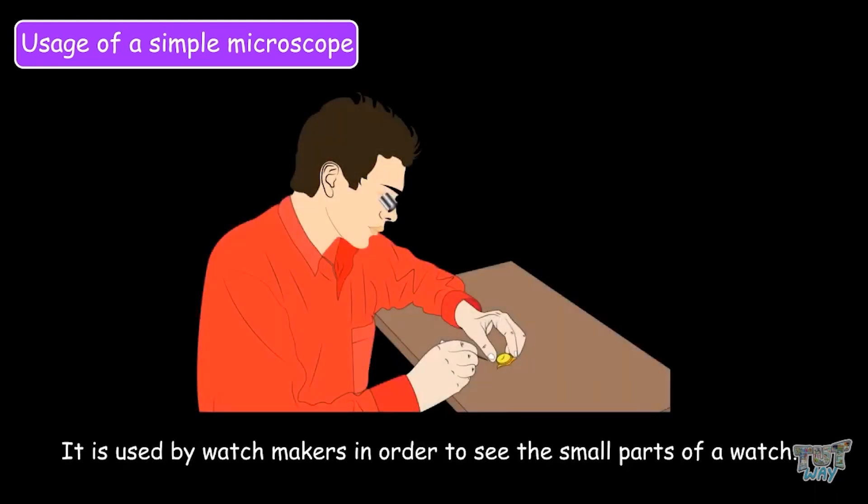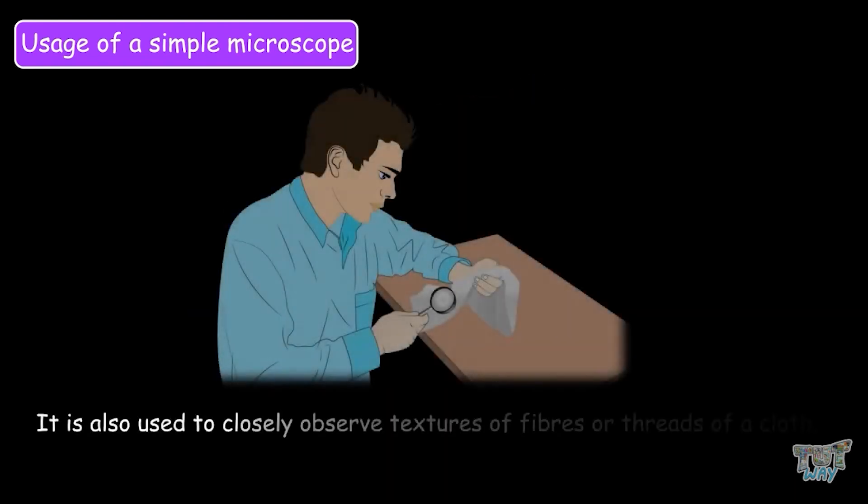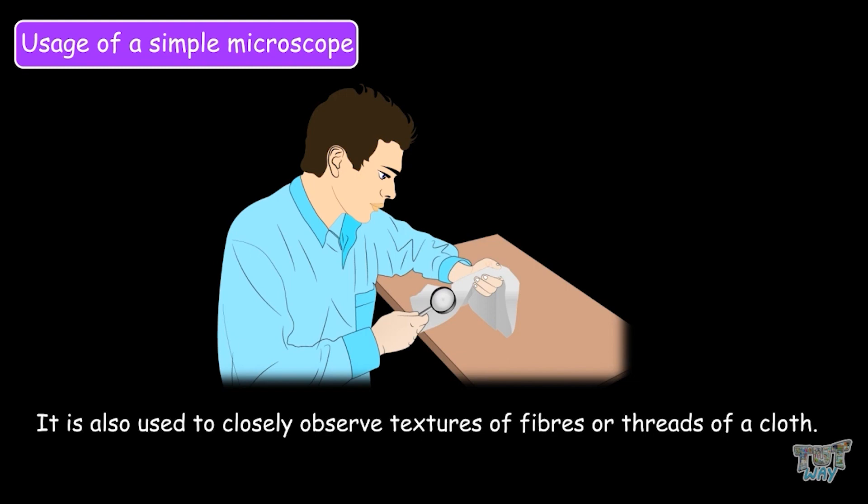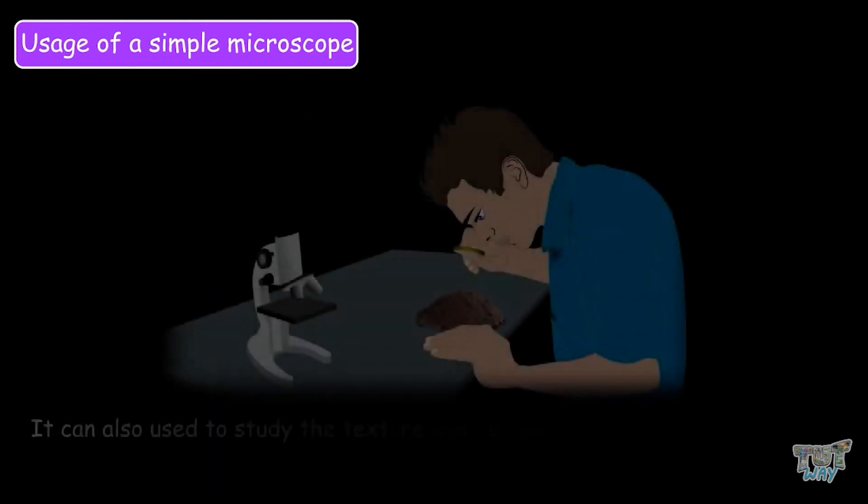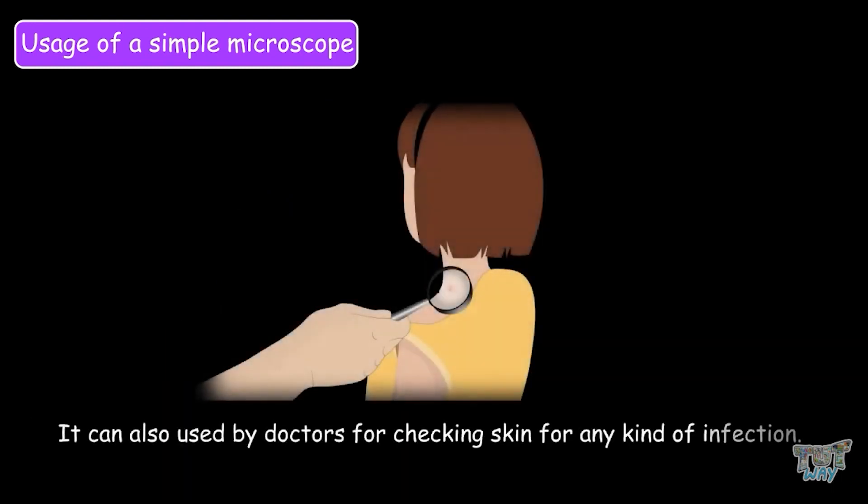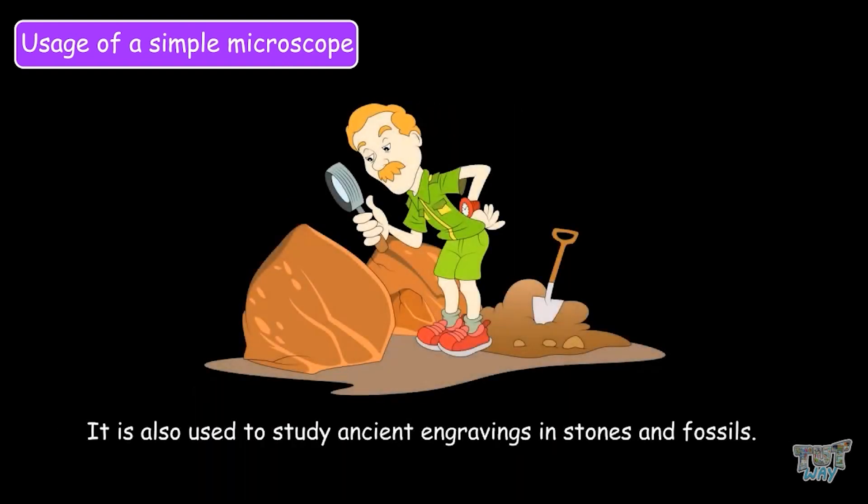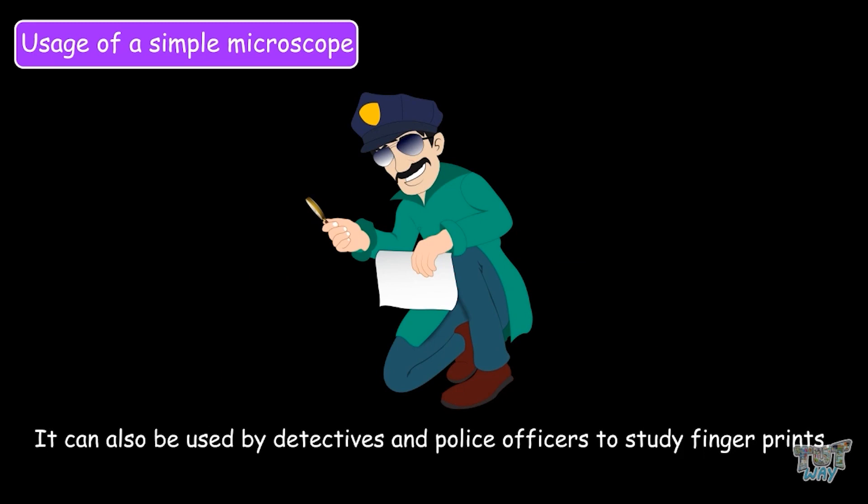Now let's learn the uses of the simple microscope. It is used by watchmakers in order to see the small parts of the watch. It is also used by jewelry makers so as to make beautiful jewelry. It is also used to observe textures of fibers or threads of a cloth. It can also be used to study the texture and composition of different types of soil. It is also used by doctors for checking the skin for any kind of infection. It is also used to study ancient engravings and stones and fossils. It can also be used by detectives and police officers to study fingerprints. So these were some of the uses of the simple microscope.